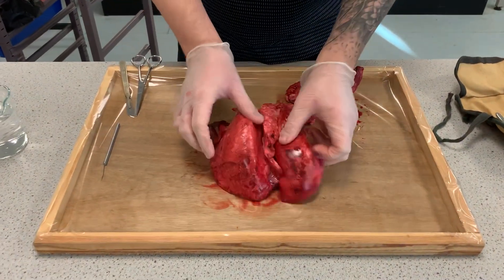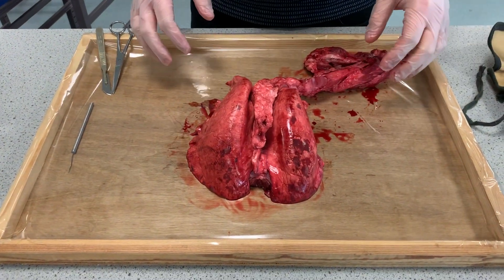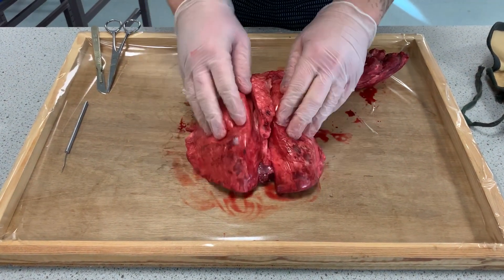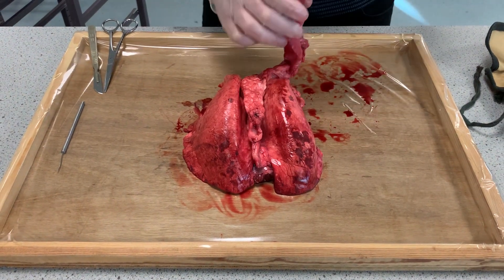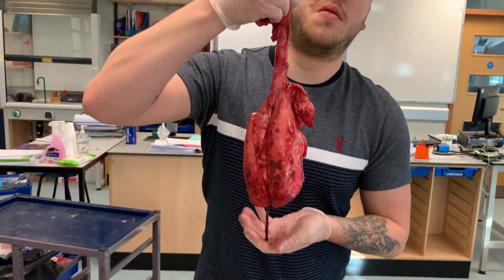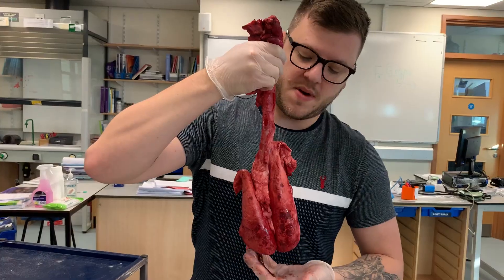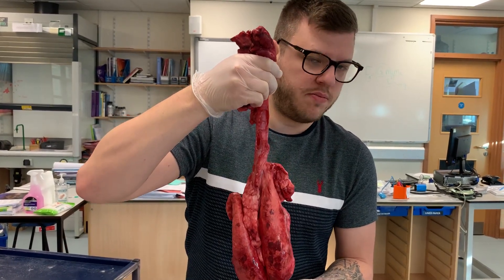So here we have a set of lungs — an actual set of lungs from a sheep, I believe. As you can see, they're a decent size. Now, if you imagine these inside of a human, we can hold them up — they should go about around here. Inside of a human, they'll be quite a bit bigger.